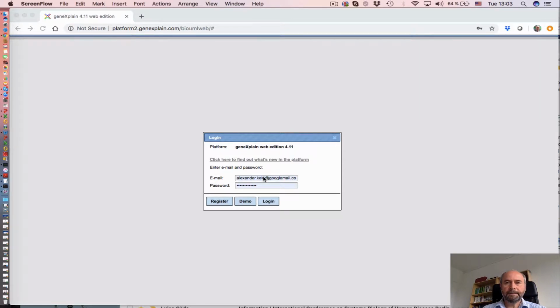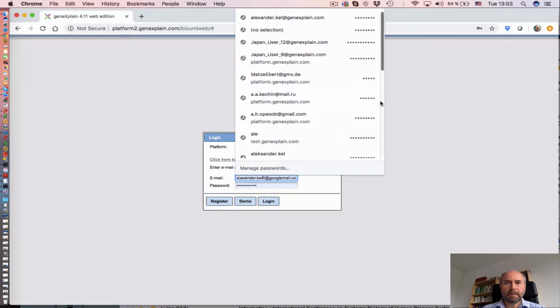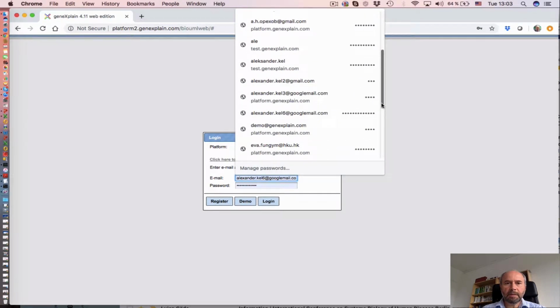Hello everybody. Today I will be showing how to edit workflows in the geneXplain platform. Let's log in to the geneXplain platform. This is one of my logins.